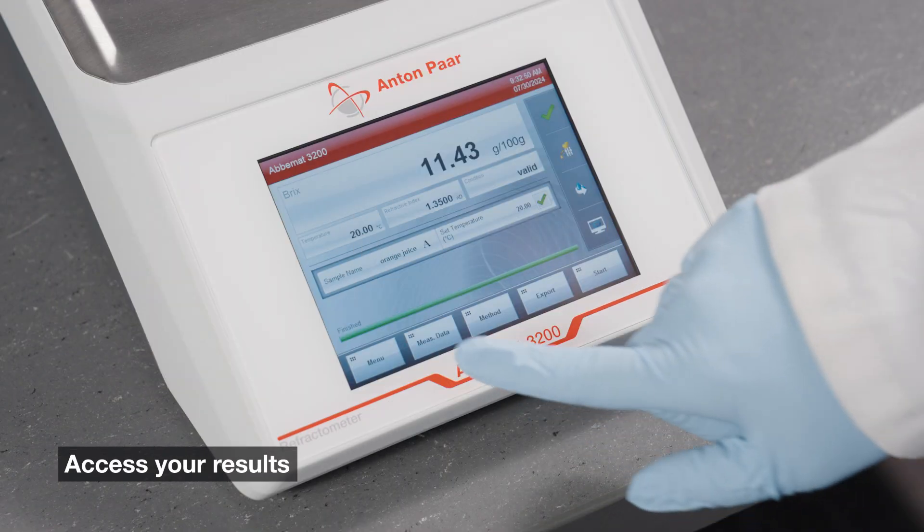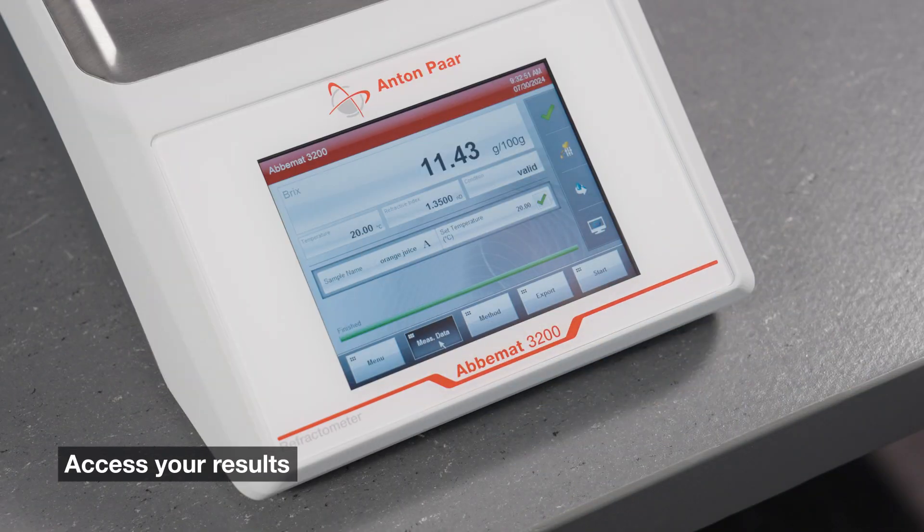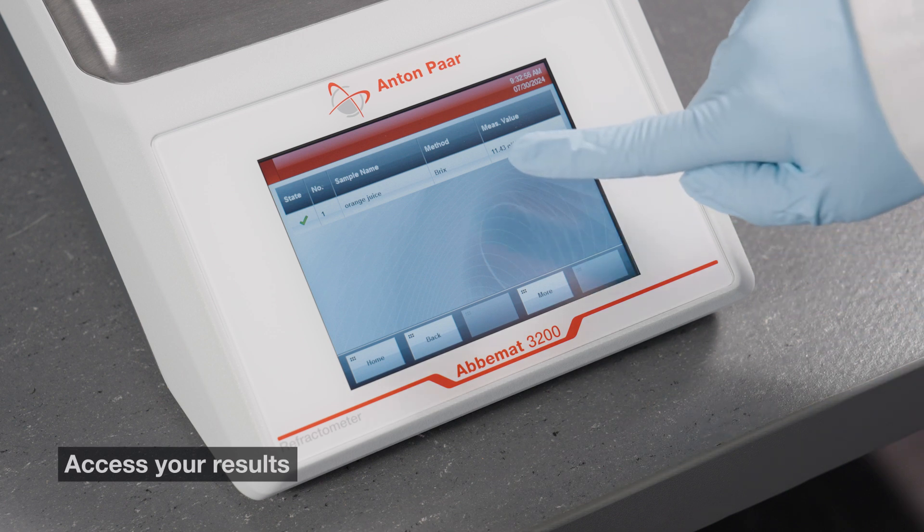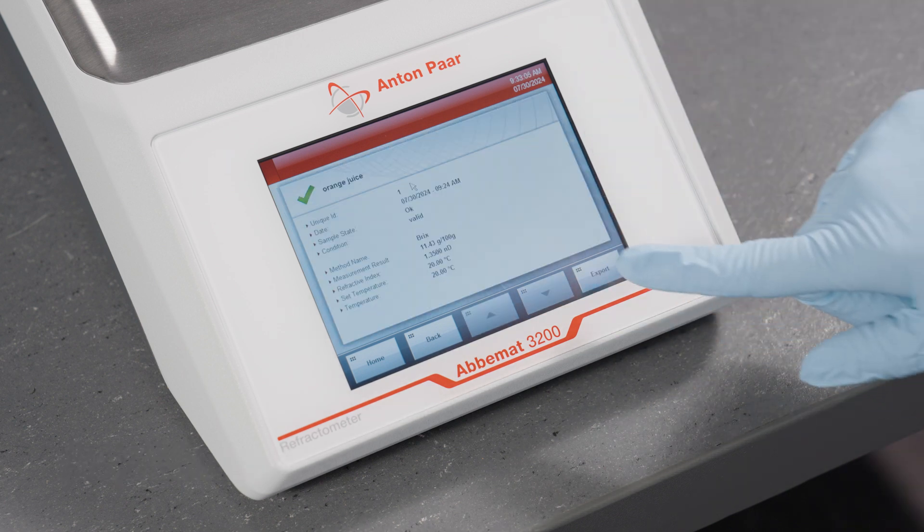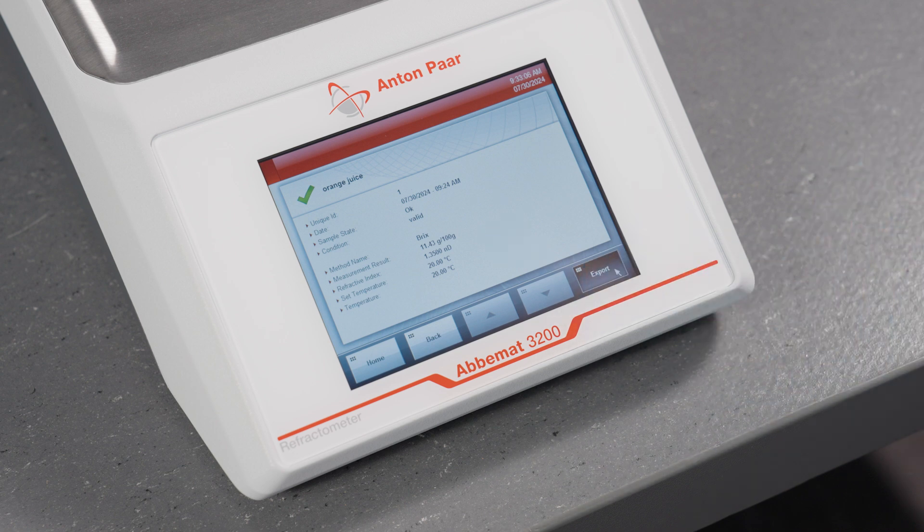View results by selecting measurement data. Print or export data using the export function. Data can be printed or exported to a USB device.